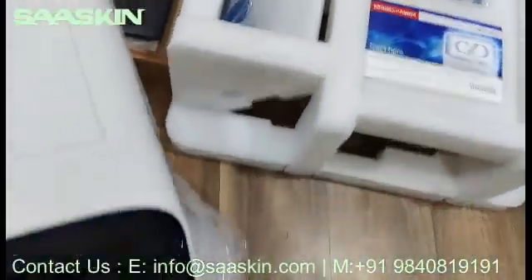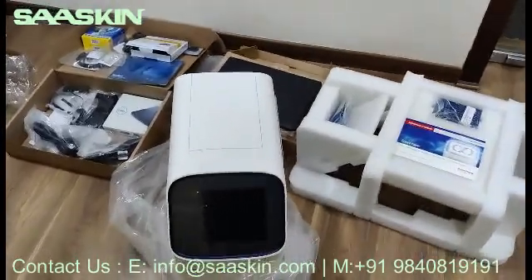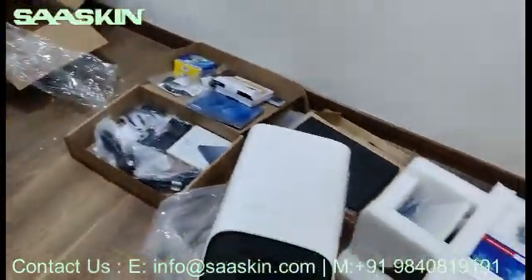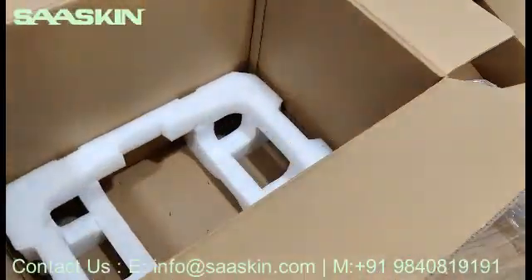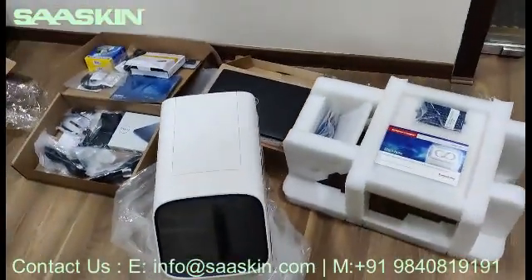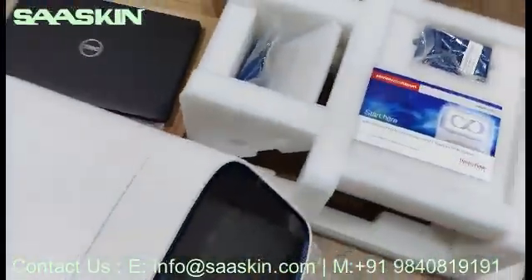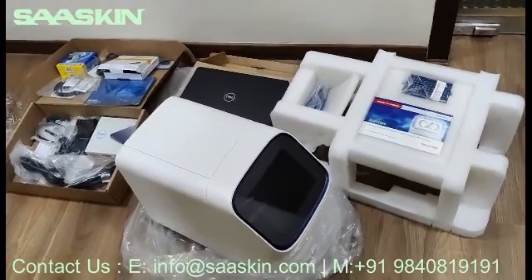I hope you get a complete idea about what you get along with the instrument. This is how the total instrument looks like. This is the total box, this is the instrument, and this is how the packing comes — well packed. This is the complete set. Thank you.